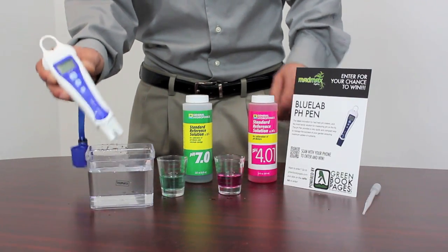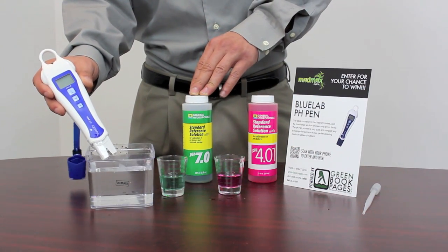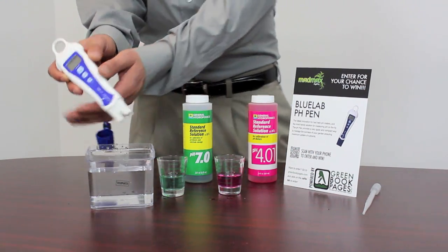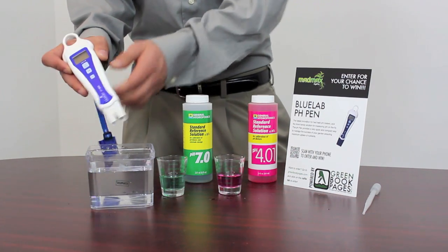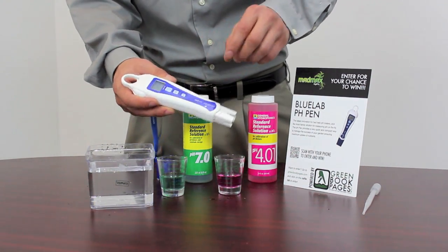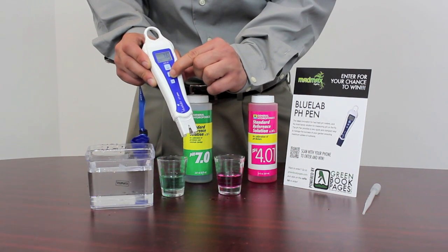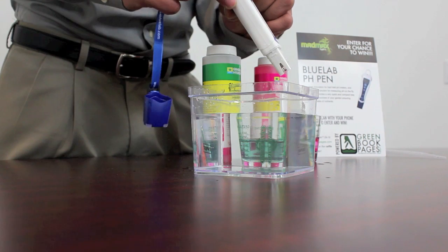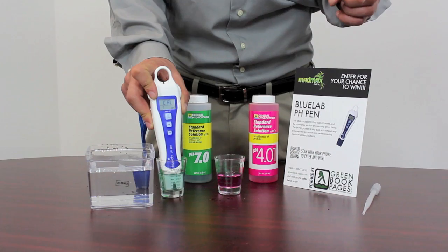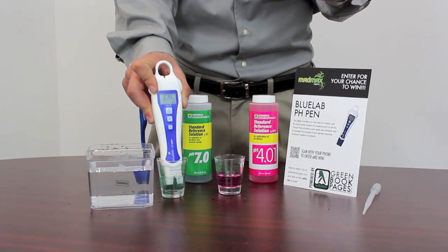To calibrate this device, first you'll need to pick up General Hydroponics pH 7 and pH 4 to set the range for your measurements. Let's start by turning it on, then you'll hold down the calibration button until CAL is displayed in the LCD. Dip it into your pH 7 solution — a 7 will be displayed underneath the calibration.